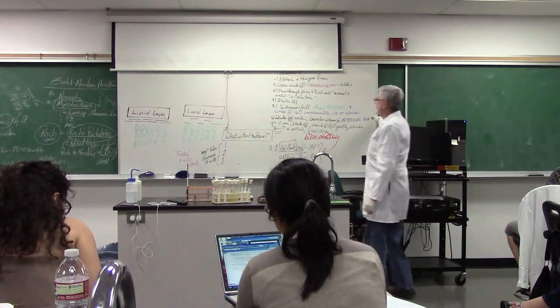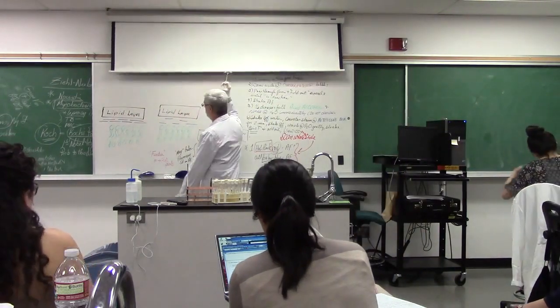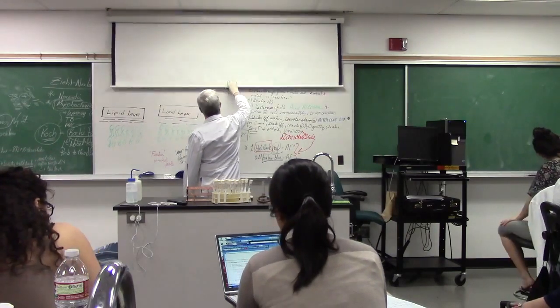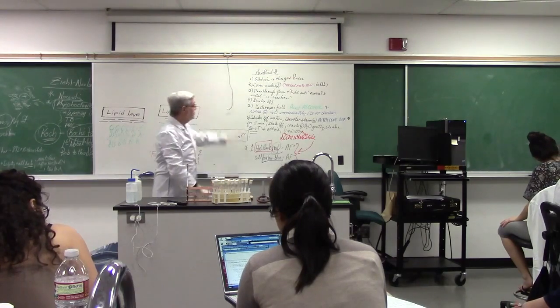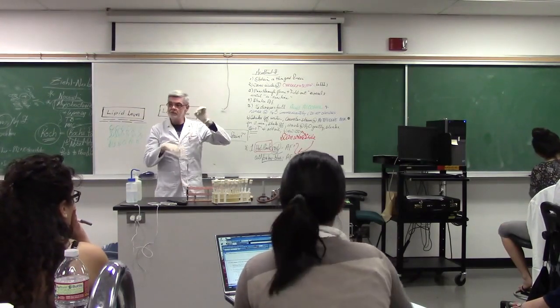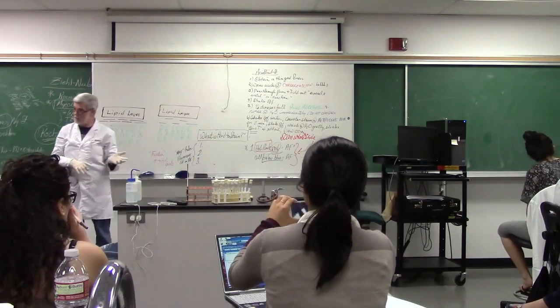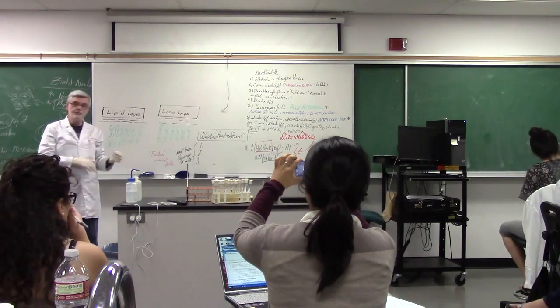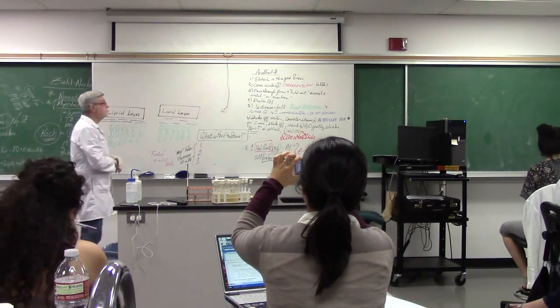So, the acid-fast stain: you're going to get a properly made smear, and remember I'm going to show you in a few minutes how to do it, but make sure it's thin. And by the way, remember this one, if you're doing mycobacterium, and we all want you to do a mycobacterium, remember those chunks, you've got to beat them. You get them broken up.